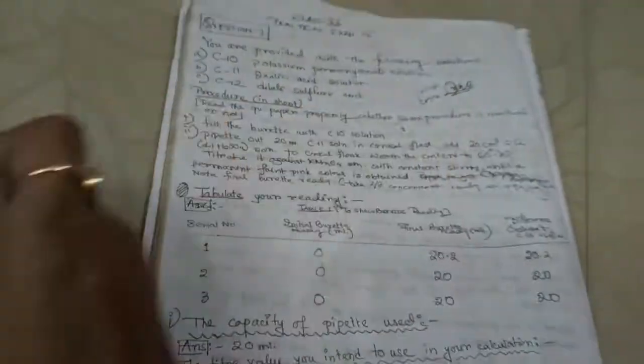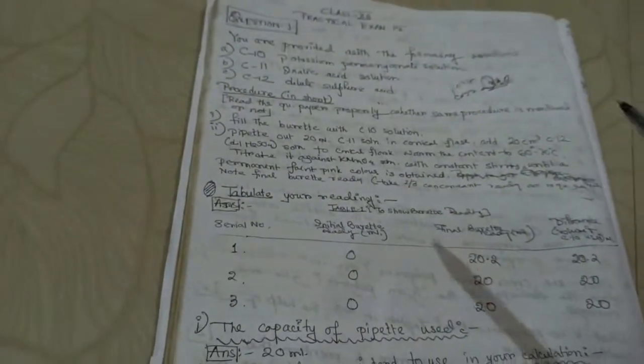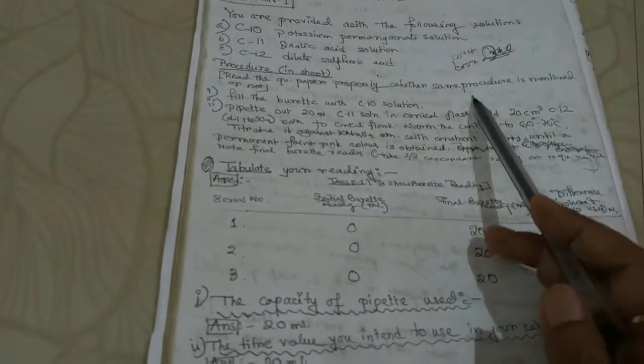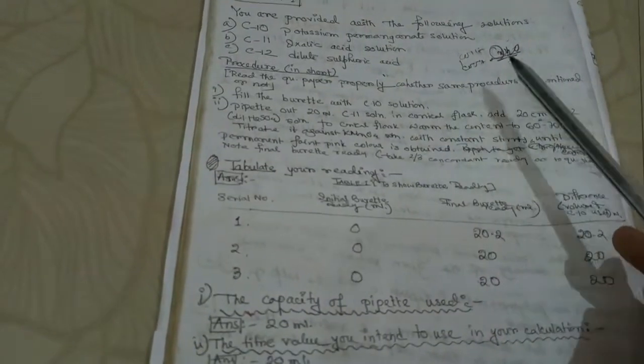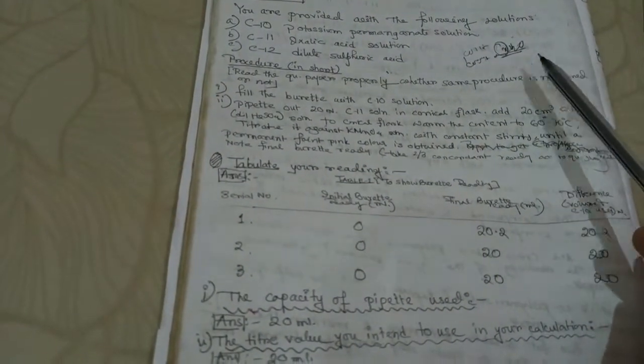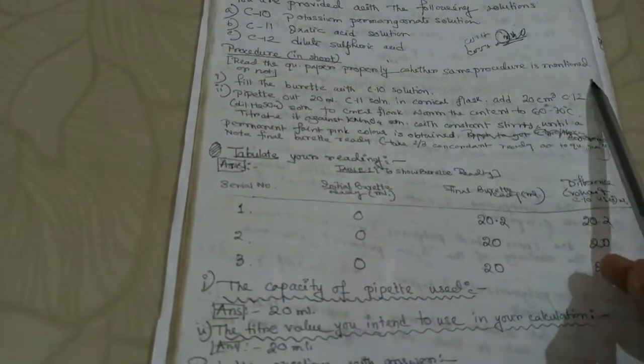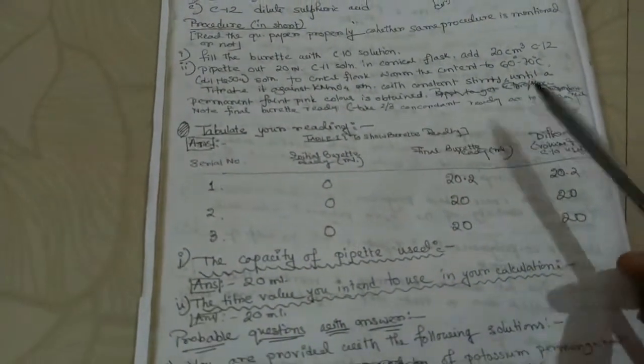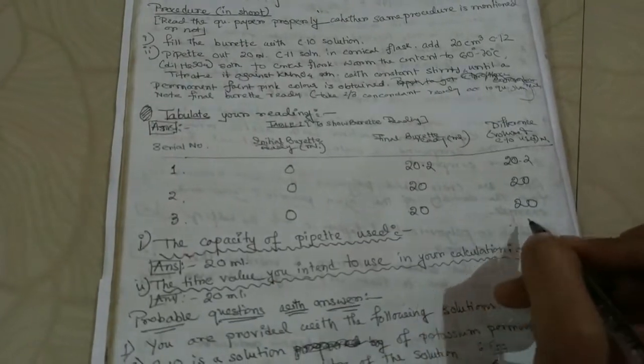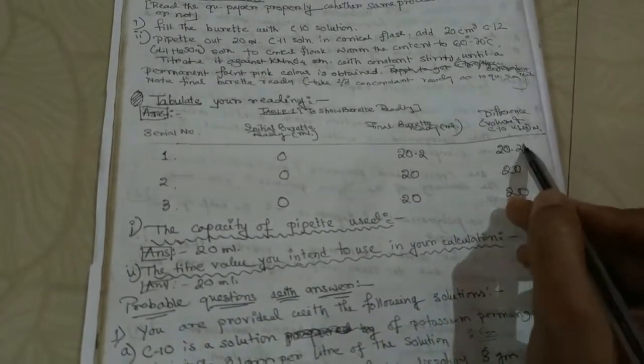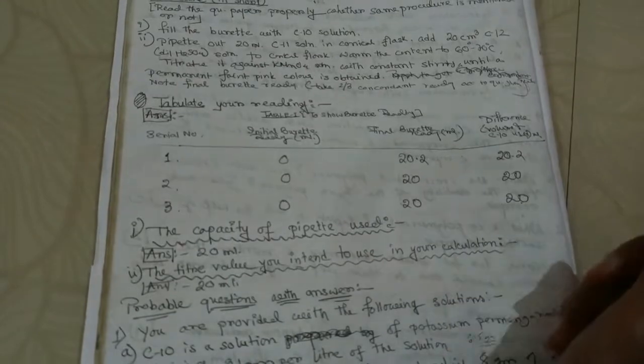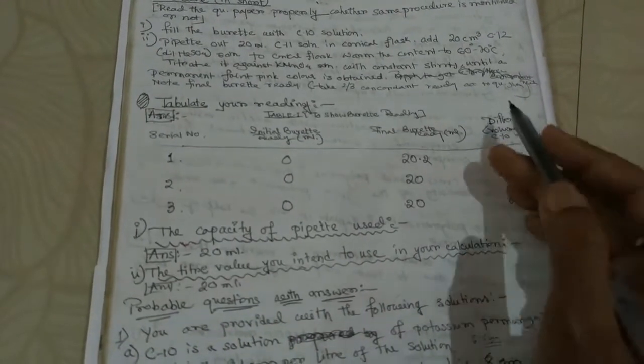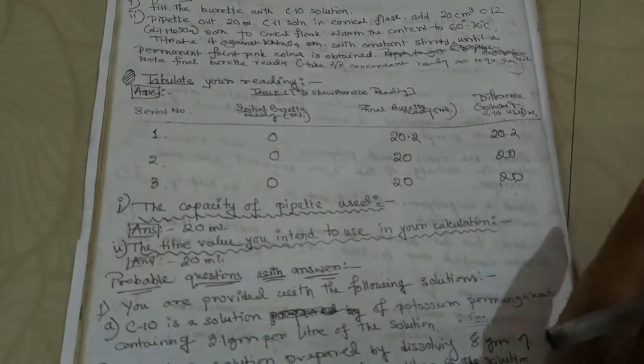For that you need to have first calculation because molecular weight initially you cannot calculate as it is XH₂O. So you need to find out the strength from the burette reading. Now you can consider the burette reading that has come during the practical or you can use these data as well: 20.2, 20, 20, 20. These data also you can use or previous data, anything you can use. If you are using these data then calculations will be accordingly.